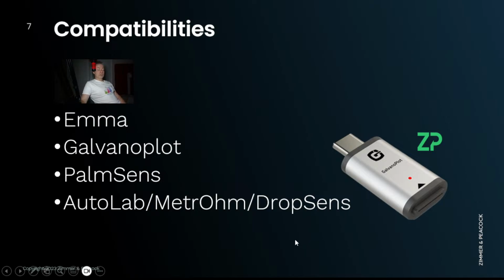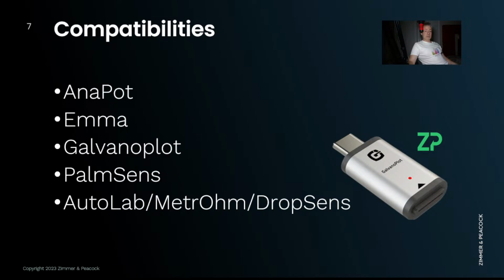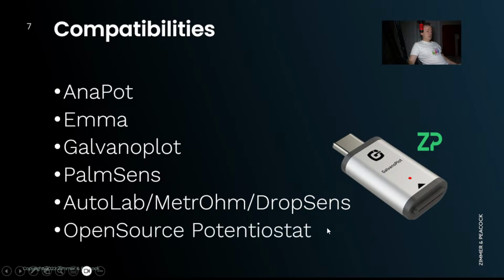By the way, if you have trouble uploading data from a particular potentiostat that you're using, please reach out to us, because this is how this webinar came about: somebody was having a slight issue with uploading data from this GalvanoPlot potentiostat, and we showed them how to use it. We're also quite interested in people being able to use open source potentiostats with Djuli as well.